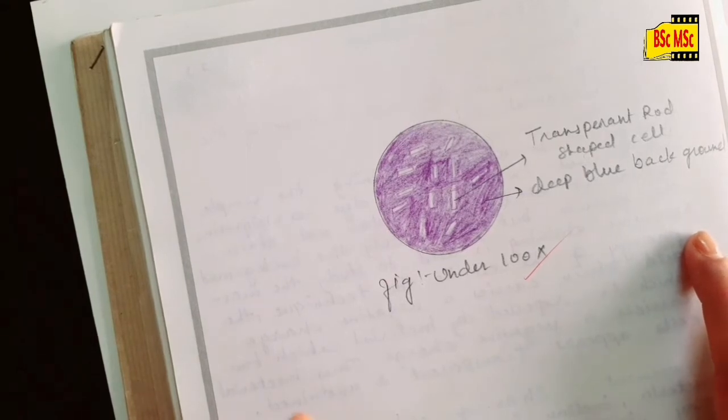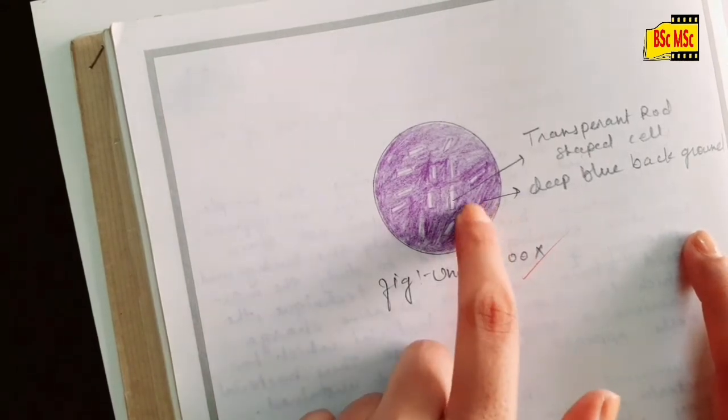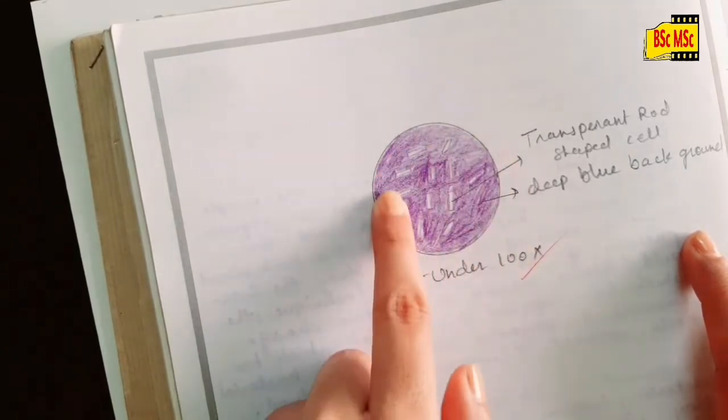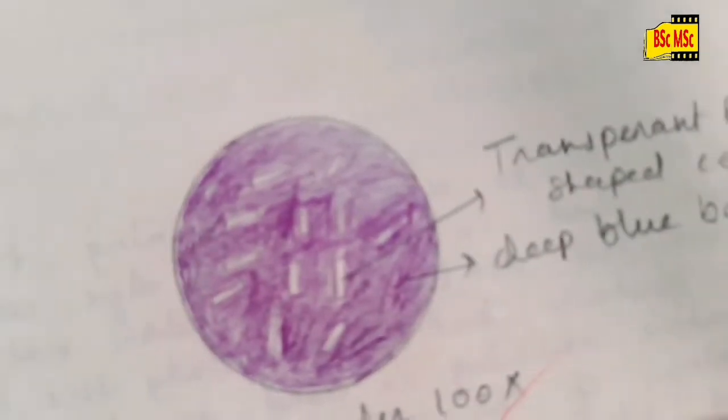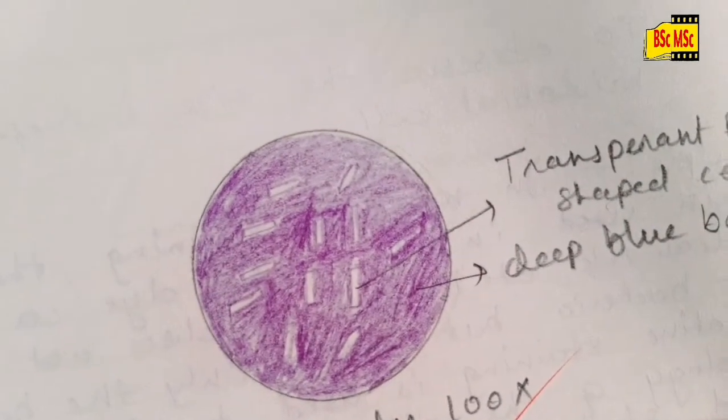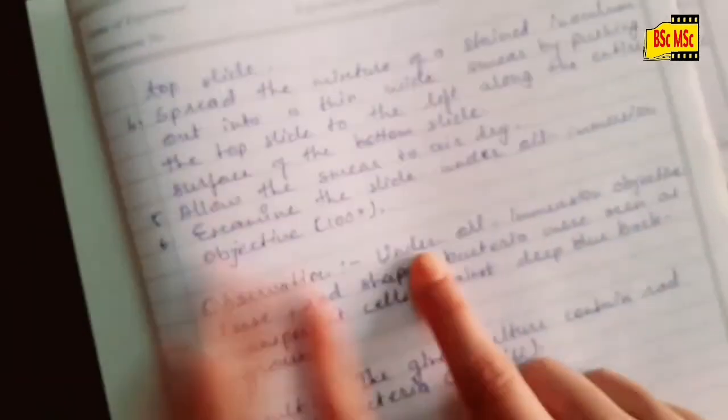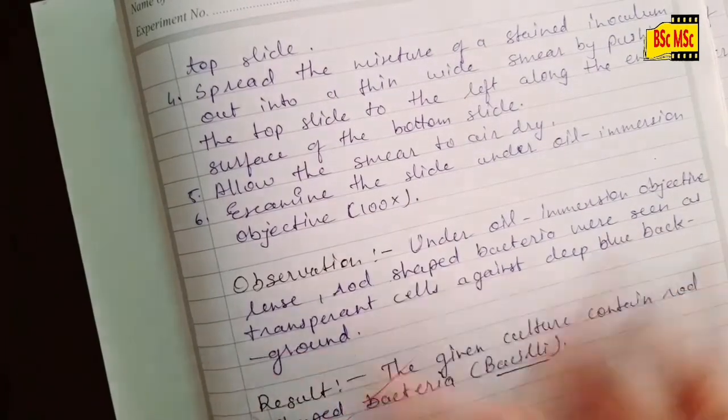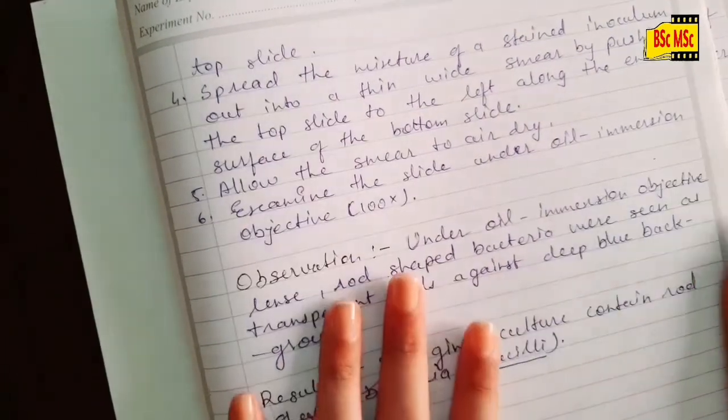See, this dark blue color is the background because of the ink, and you can see the rod-shaped bacteria. I have written the observation over here. So this experiment ends now.